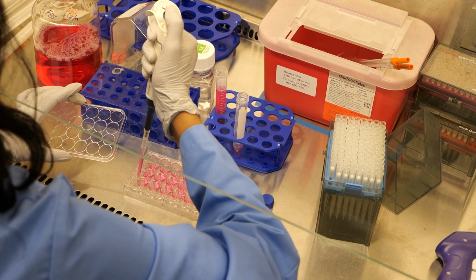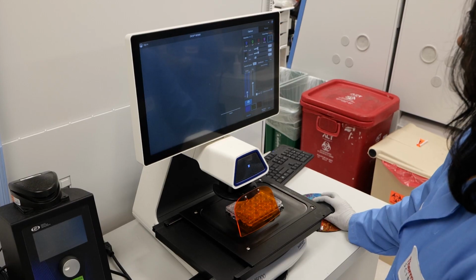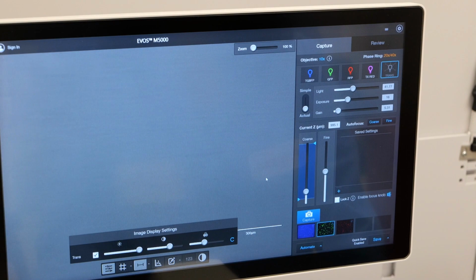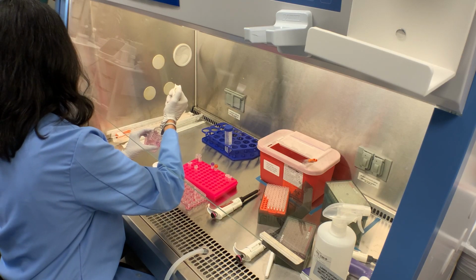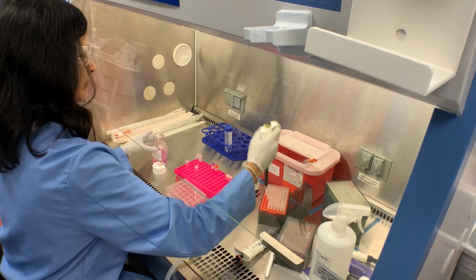For this experiment, we will use a 24 well plate, plating 40,000 to 90,000 cells per well in 0.5 milliliters complete medium. On the day of transfection, first check your cell health and for signs of contamination before proceeding. Once your cells are deemed healthy, a new gRNA needs to be resuspended in TE buffer to a concentration of 100 micromolar and stored at -20 degrees C.